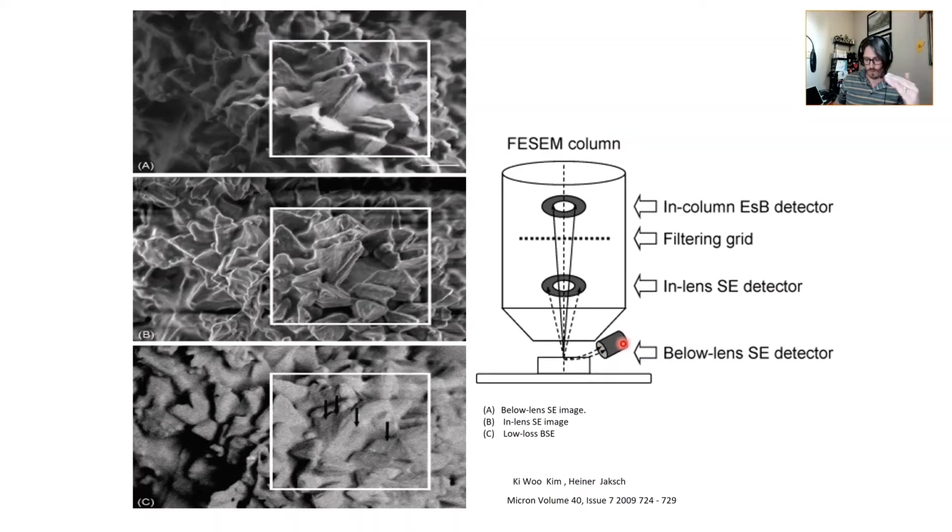Okay, and if you remember back on that 4800, they have a traditionally placed secondary detector kind of at the back side, but then they have that kind of higher one, which is designed to compete with Zeiss basically. But you see, their premise is that the best is in lens.